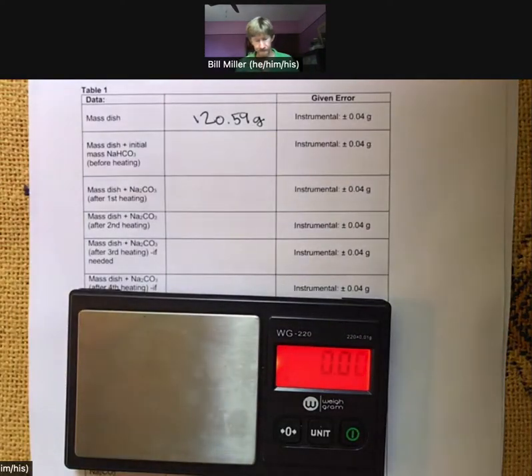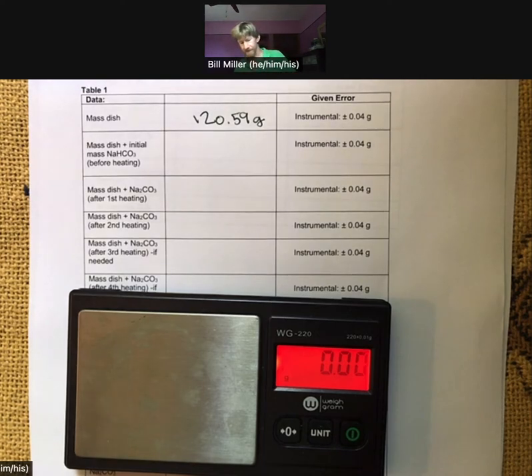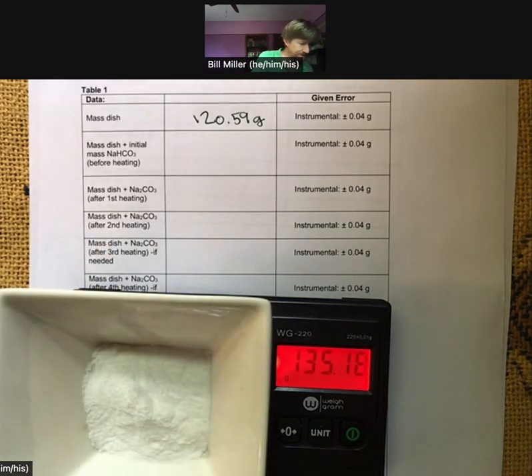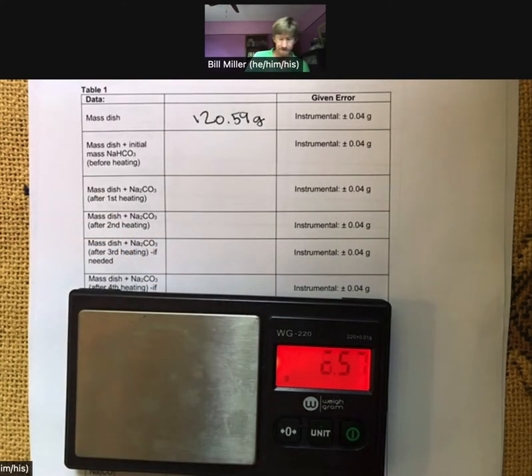There we go. And then add approximately 30 grams of baking soda. I'm gonna do my best here. It's pretty powdery, this stuff. I don't know what 30 grams is, but I'm gonna just grab about that much. So far I have about 15 grams. So I'll approximately double that.